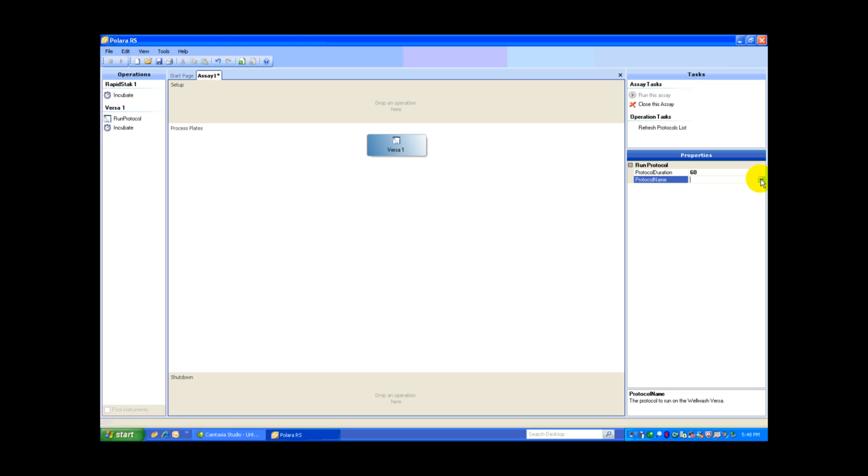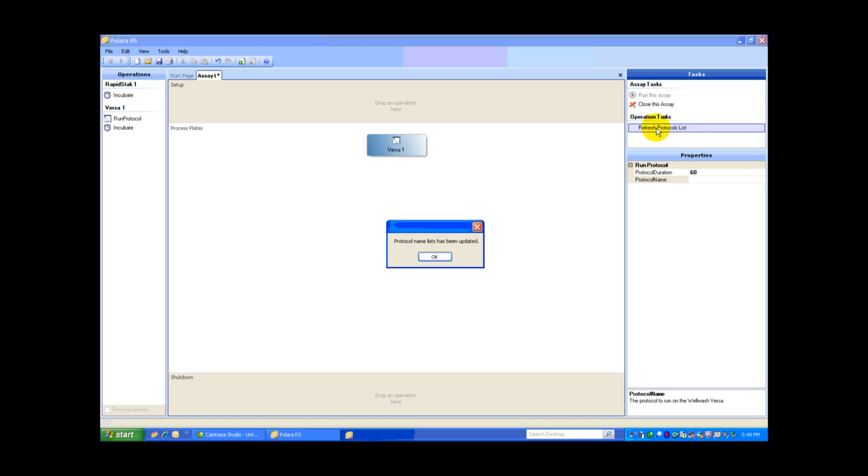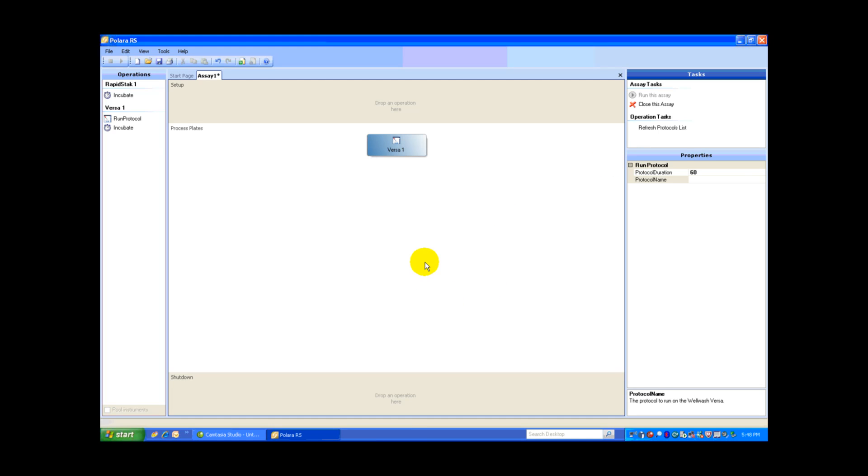Then I'm going to identify the protocol. You'll notice here under the Properties, the protocol name is blank. So what I do, I go up to the Operations task and I select Refresh Protocol List. What this does is actually pull through all the saved protocols that have been built, identified, and saved on the WellWash Versa. We can see here protocol name list has been updated. Select OK.